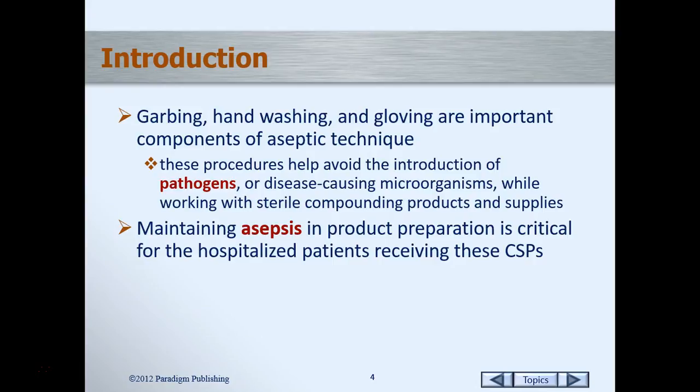So currently, the USP 797 mandates that all sterile compounding personnel wear sterile disposable gloves when preparing compounded sterile products. Again, as I stated in the previous introduction, that's a best practice. Reality is some facilities do not always use sterile gloves, but it is a best practice. We will learn the technique of the appropriate guideline of using sterile gloves, but we will also practice how to properly disinfect a non-sterile glove.